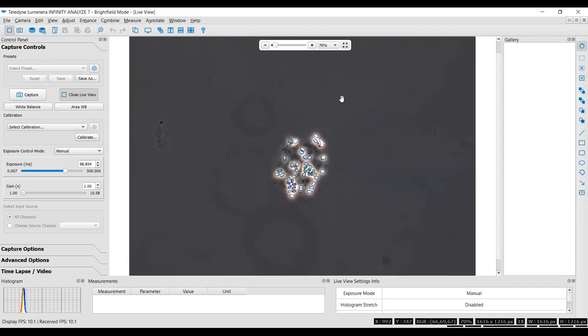You know, the question is, are you going to look for 400 of these colonies? No, you don't have time to do that. So, you know, you're going to come up with a way, whatever your way is, to cut your time. If I were to count individual cells on this, I have my personal threshold, but I can modify the density I count at easily with the slides, is that I go to 400 natural units. If there's single cells like that, I try not to include them in the threshold, but sometimes it's impossible. And so I quit after 100 fields or an hour of time.